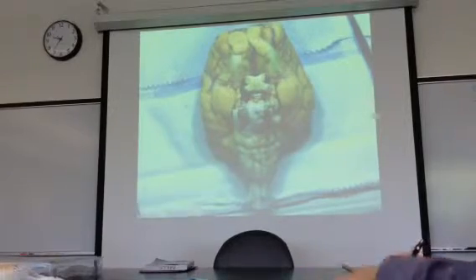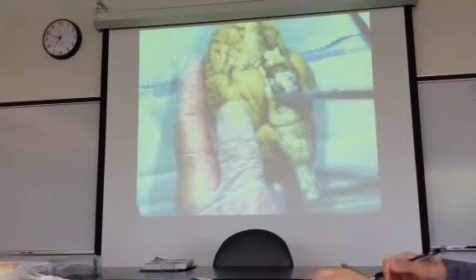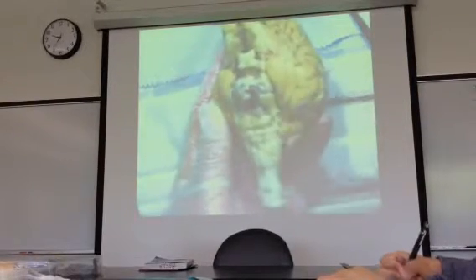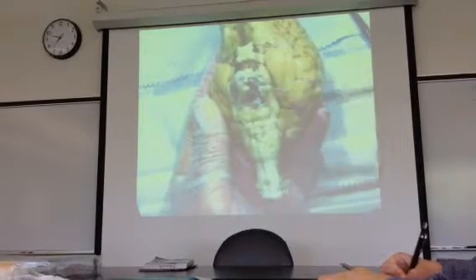You're going to need some scissors. Okay, first of all, here's the pituitary gland. See this long sort of white structure? You can see it easily here, and then it's covered with other stuff up here. That's a cranial nerve. That's trigeminal 5. And that's assigned on the sheep brain. We've got to save that.